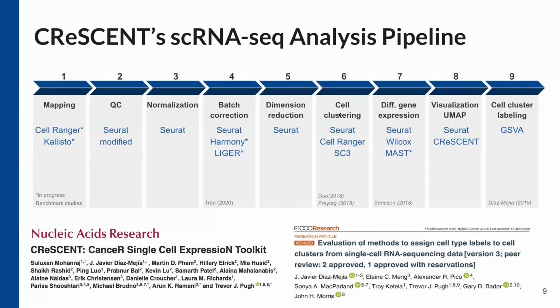So once we have these cell clusters, once we've separated these cells into their different colors and clusters and what we see as these t-SNE maps, we can also do the differential gene expression. So what genes are actually significantly expressed compared to another cluster, and that might tell you this group of cells is a clone, and they express quite similarly, except there's a different gene expression that's being expressed in this very specific cluster, and so means more exploration needed type of thing, right?